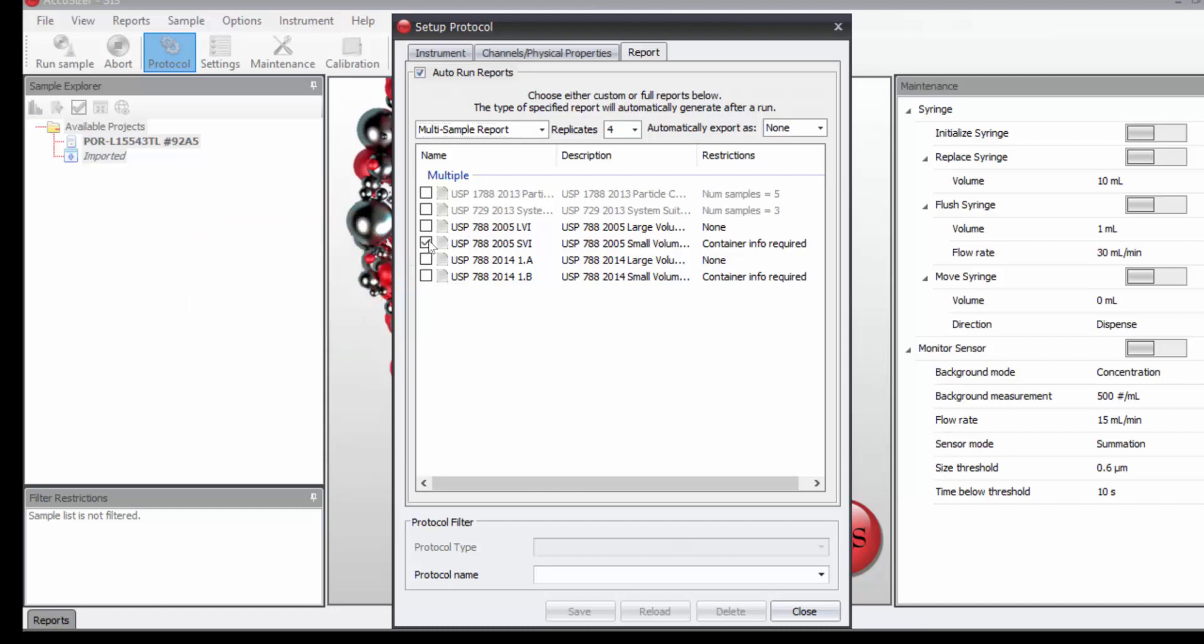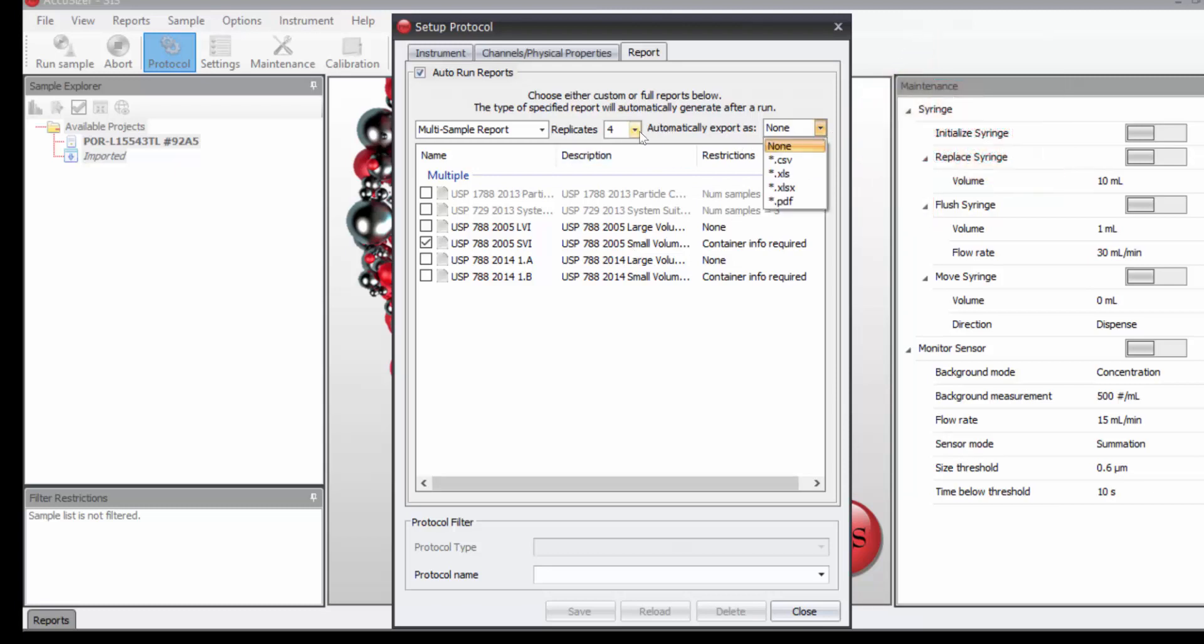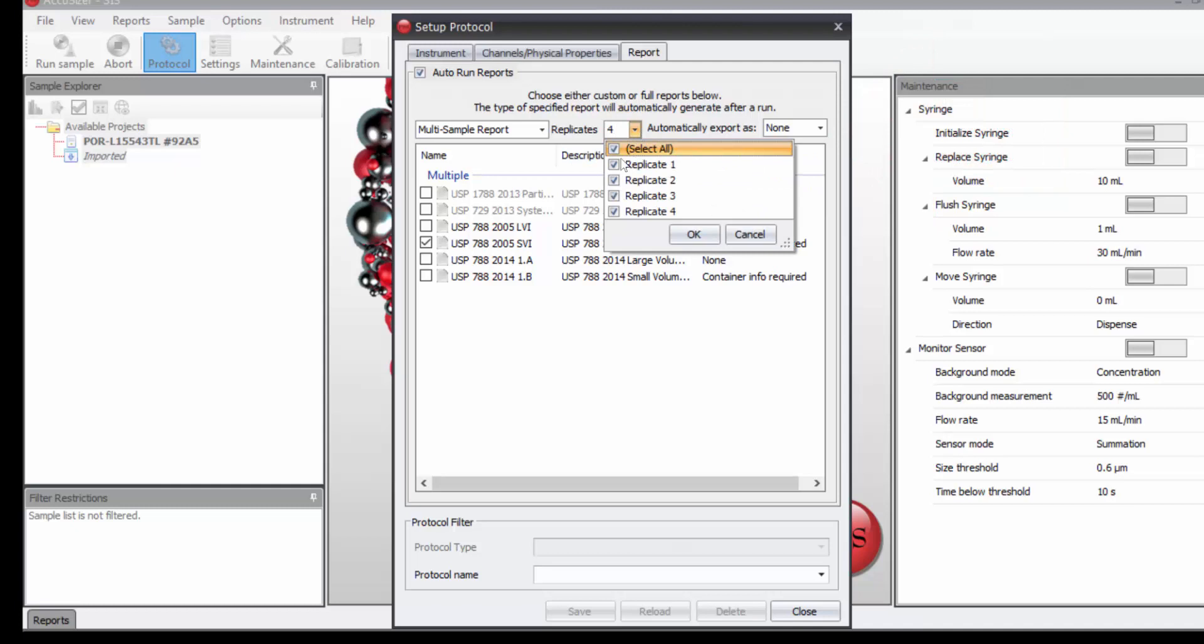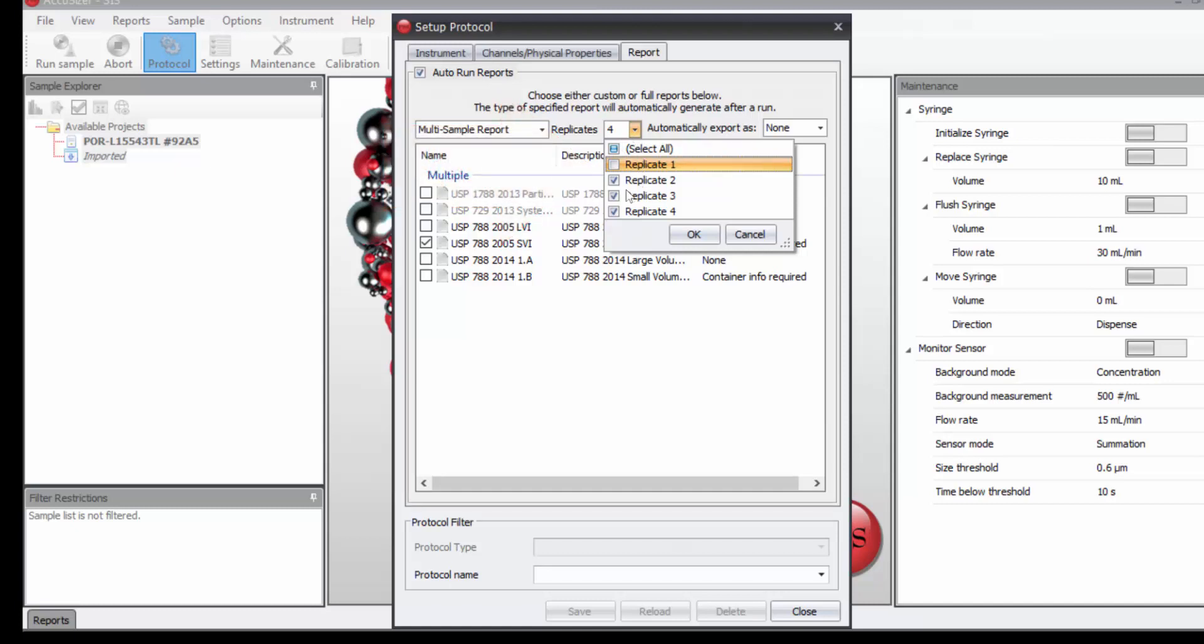And you'll see the container information required, we've already entered that. We know there's four replicates, but what we want to do is deselect the first. Then it will pull the first, but not include that in the calculations. So we have selected replicate 2, 3, and 4.